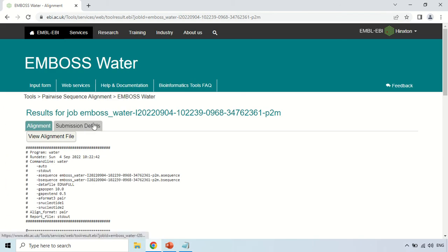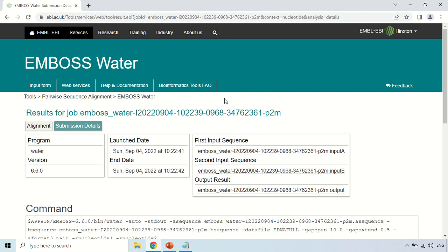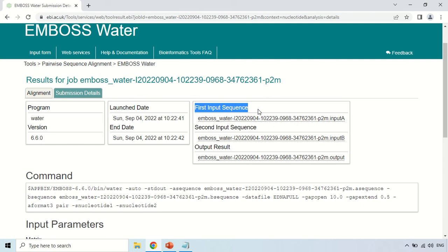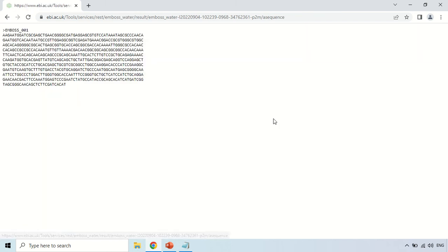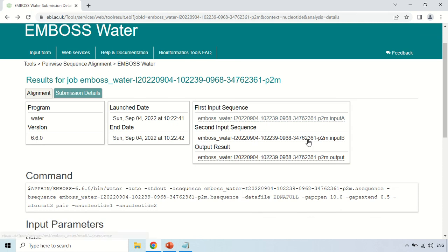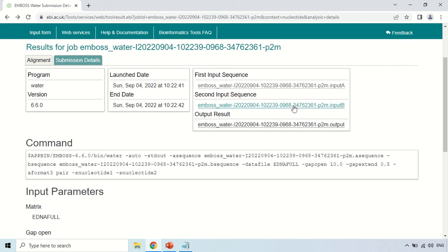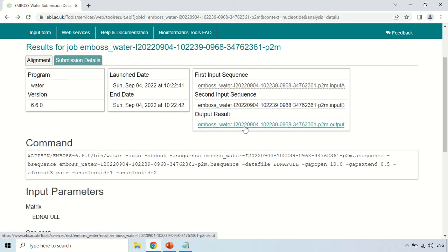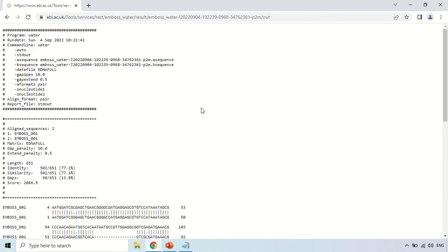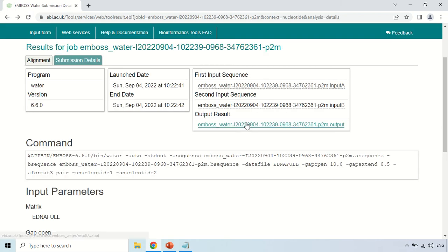Under the Submission Details tab, if you click here it will show information about your submission: the program run was EMBOSS Water, version 6.6.0, the launch date, and when the result was available. It also shows a link to the first input sequence and the second input sequence — clicking each link shows you the respective full sequence. There is also a link to the output result which displays the alignment output we discussed earlier.